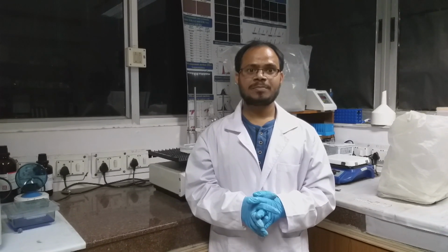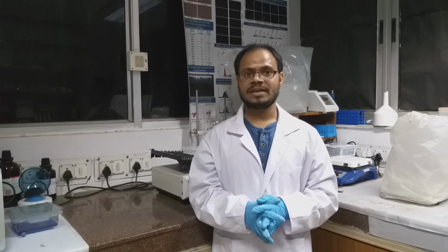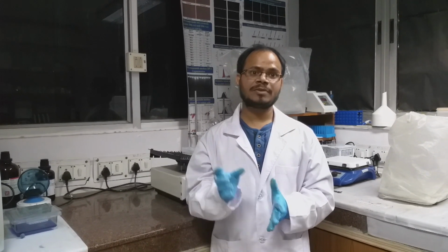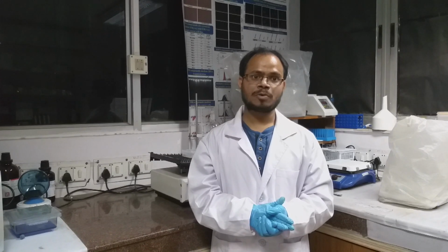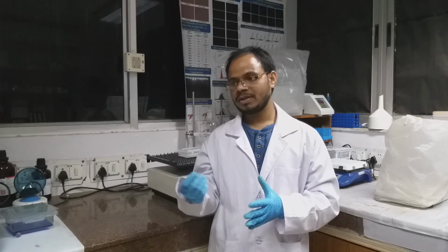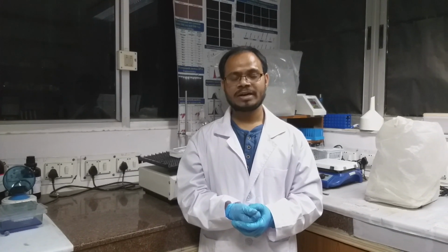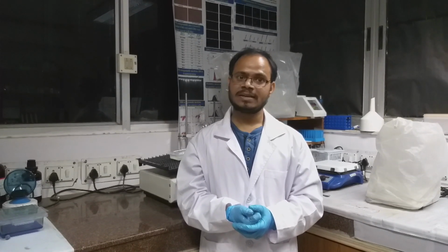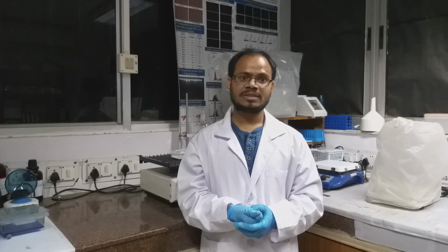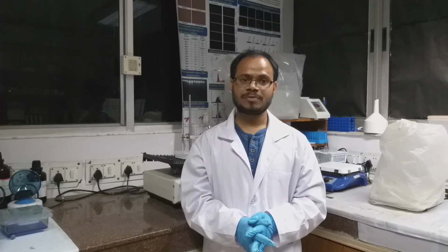After blocking the membrane, we remove the membrane and incubate with the primary antibody without washing. The main purpose of blocking is to occupy non-specific sites other than the respective protein, so that when the antibody comes, it binds to that specific protein and gives no noise. We then incubate with the primary antibody overnight at 4 degrees Celsius, then wash 3 times, at least 15 minutes each, with TBST or PBST buffer.